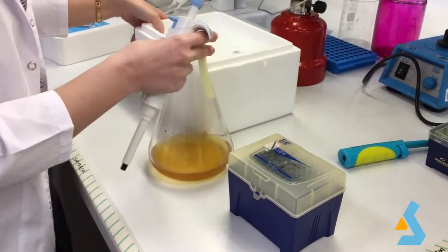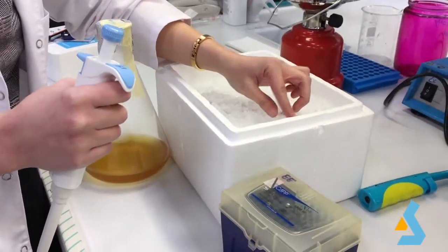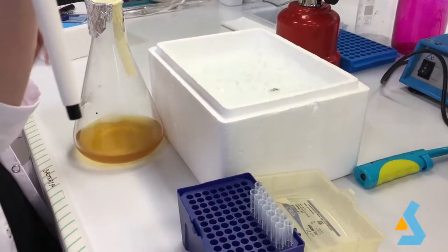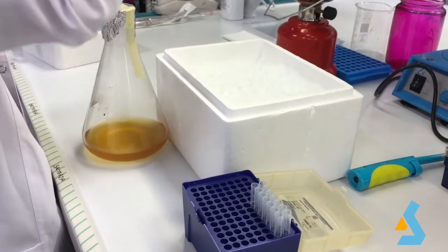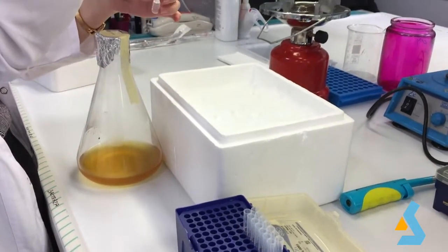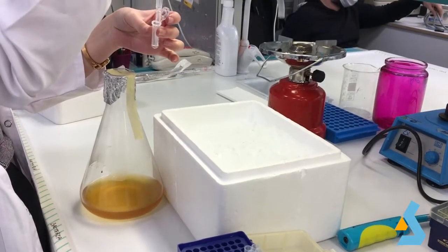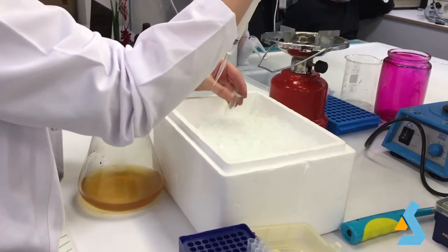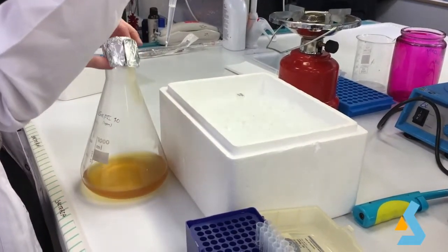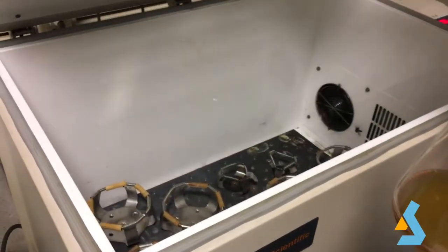When the optical density of the culture reached around 0.5, we took it from the incubator and added 1 ml of IPTG solution to induce the expression of our target protein. Then we put it back to a shaken incubator at 18 degrees Celsius for overnight induction.